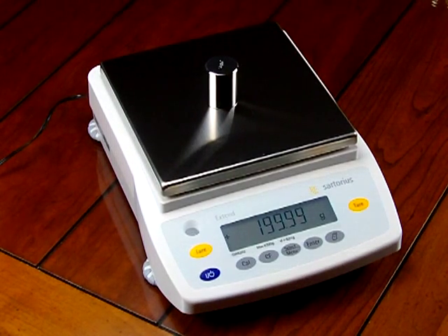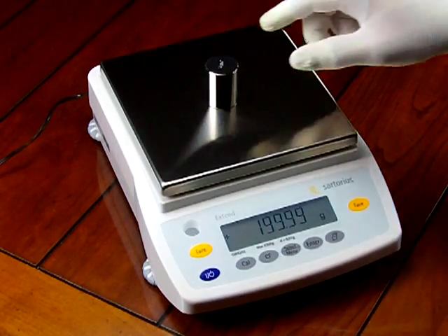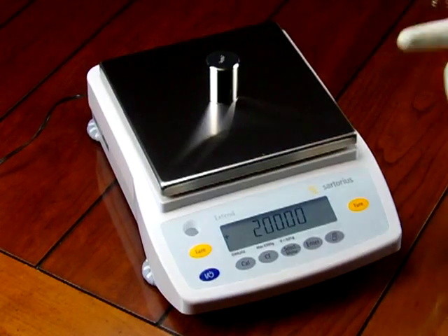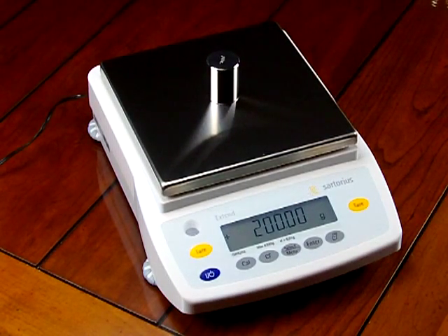When someone offers you a balance from another manufacturer, these are some questions you might want to ask: What kind of experience do they have? What kind of engineering knowledge do they have in building balances? We see the market being flooded with balances from overseas, from Europe and China. If you put a calibration weight on those balances, you're going to notice they drift. Sartorius doesn't drift.